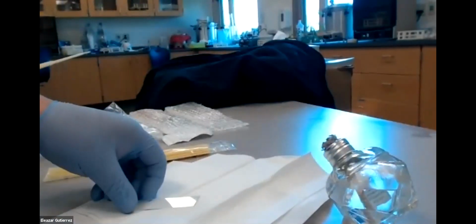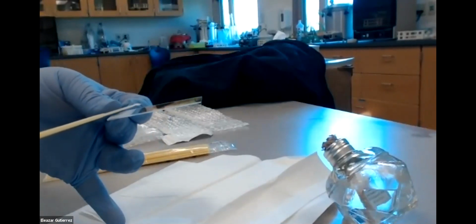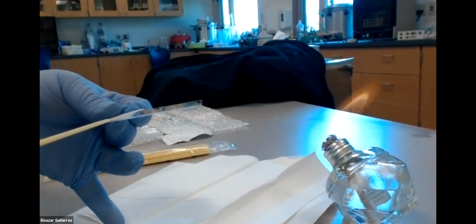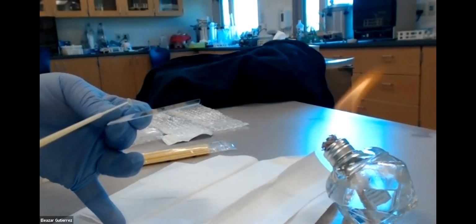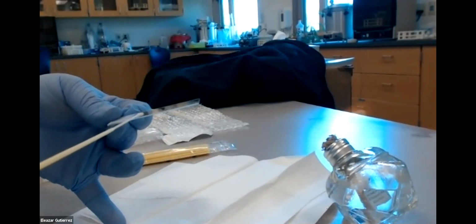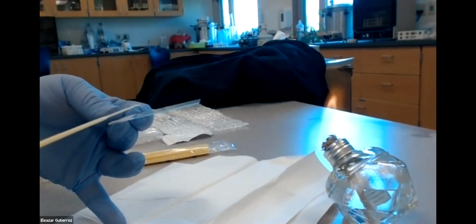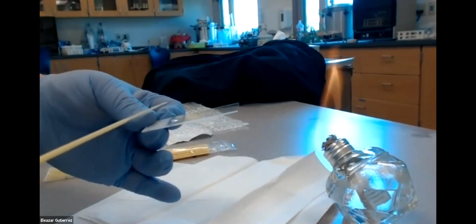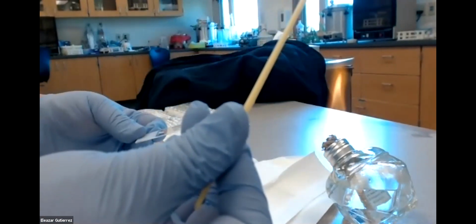Now I'm going to put it away. And I'm going to put that on my little slide on one side because I only got 2 slides and I've got 3 organisms. So I can't put it in the middle. If I do, I'm going to run out of space to do this. So there we go. A drop just went on there. This is going to go into 70% isopropyl alcohol.